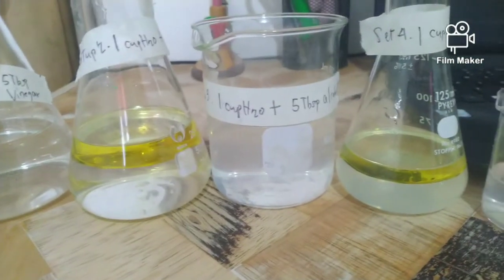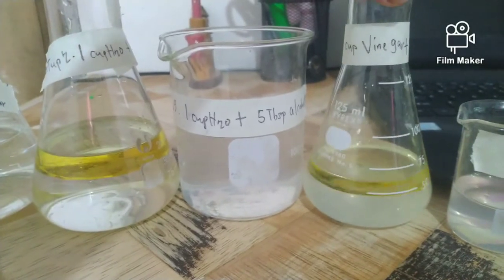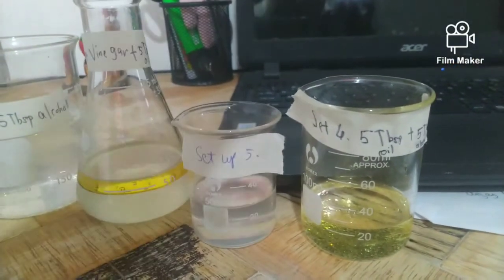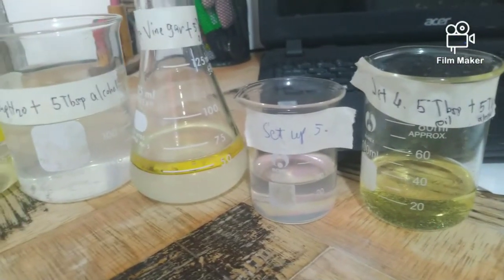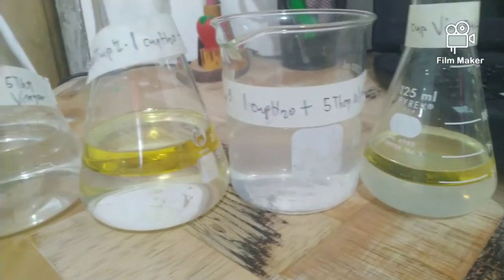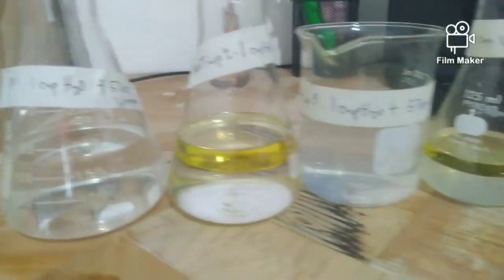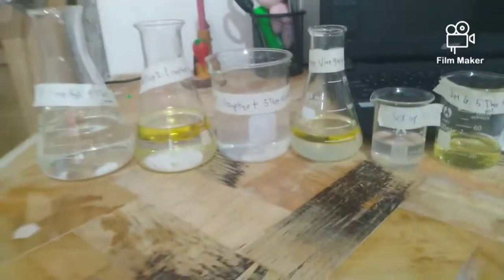Setup number 4 is the mixture of vinegar and oil. Setup number 5 and setup number 6, the mixture of oil plus alcohol. Now you can observe and distinguish which mixtures mixed together and which did not mix. Okay, thank you.